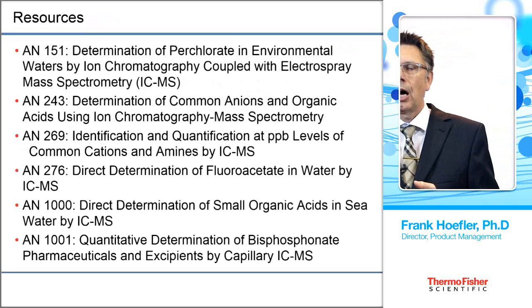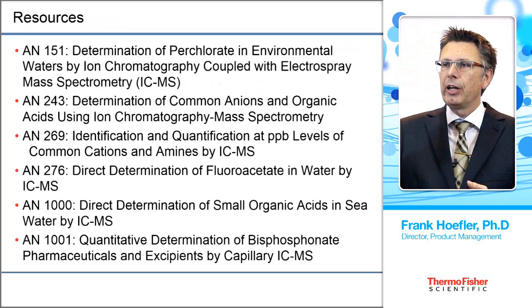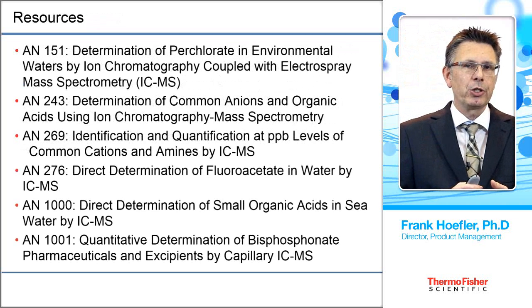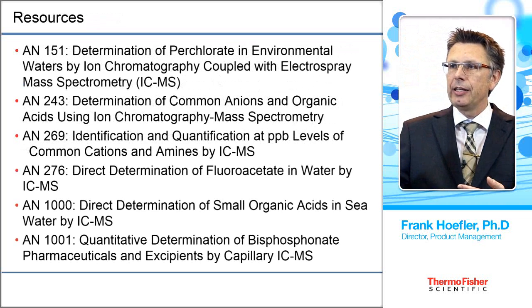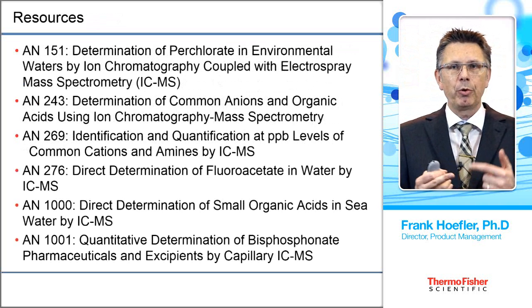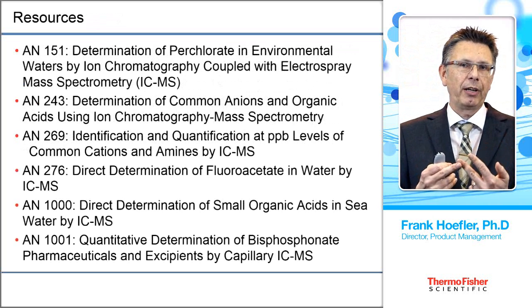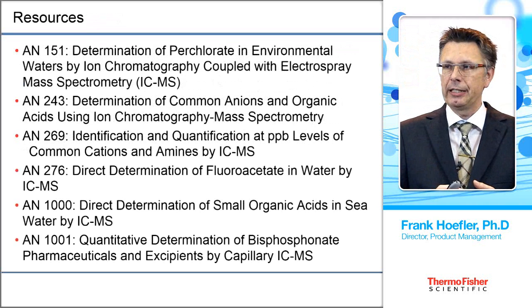Furthermore, I would like to highlight some resources if you would like to get more information. We have several application notes published so far, which you find on the Thermo Fisher Scientific website. And these application notes give you detailed information about the sample preparation, all the chromatographic and MS conditions, and make it easy for you to reproduce our data.